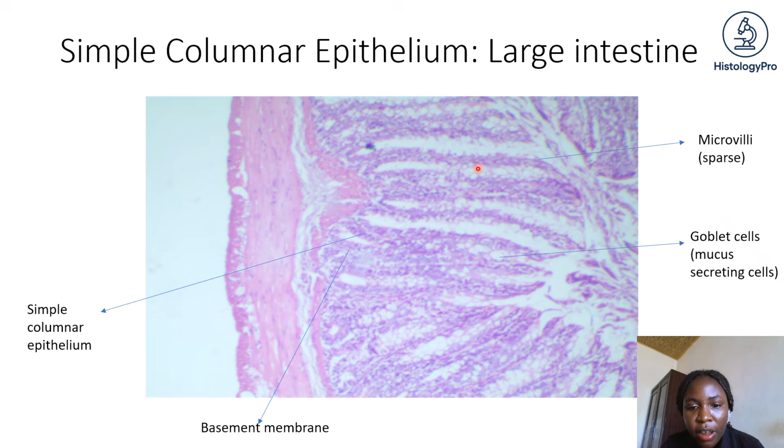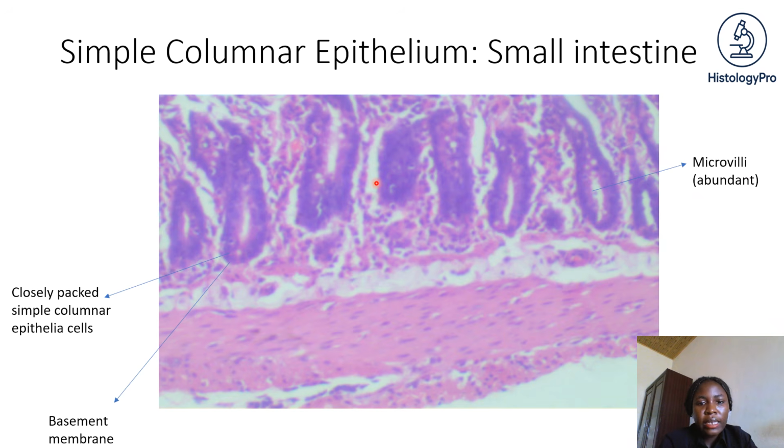The epithelium is resting on the basement membrane, and it is supported by the underlying lamina propria containing connective tissue elements and capillaries.